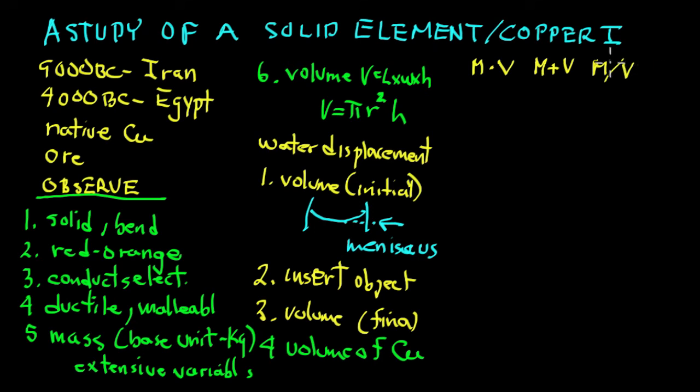we find out that every time we do that, we get the same number. And if we're using grams per cubic centimeter, we come out with 8.9 grams per cubic centimeter.